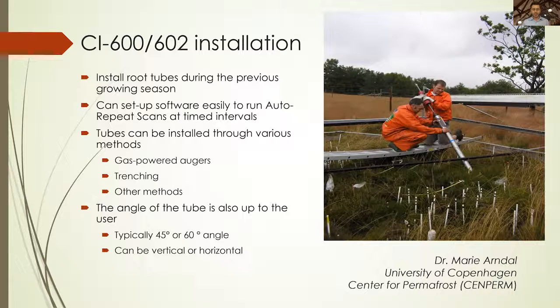Now, the other thing I would definitely mention off the bat, just having run into this experience myself, is you want to make sure that the soil is not completely compact around the tube. You want to keep it about the same density as you would typically find around that plant. That way the roots grow as they typically would, and do not bunch up because there's a lot of space, or completely avoid the tube because you've compacted the soil around it and made it difficult for them to grow around the tube.